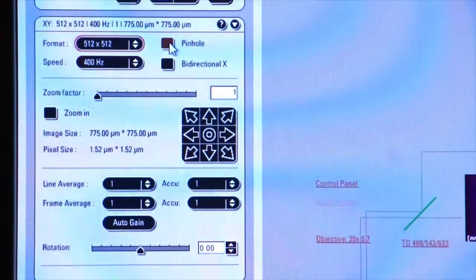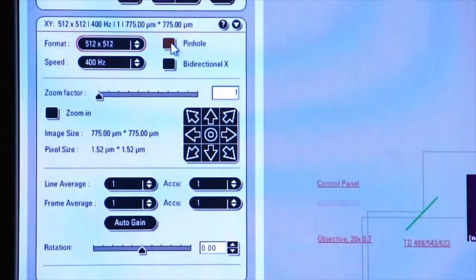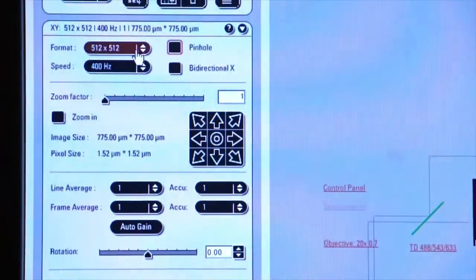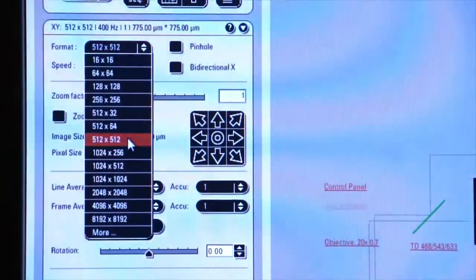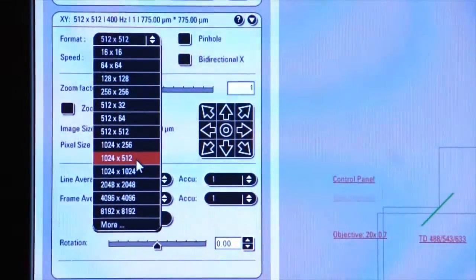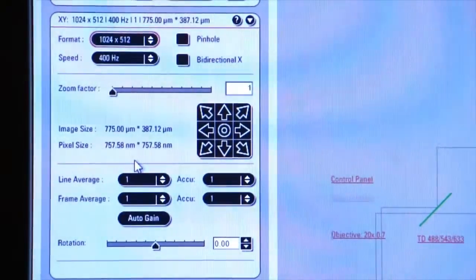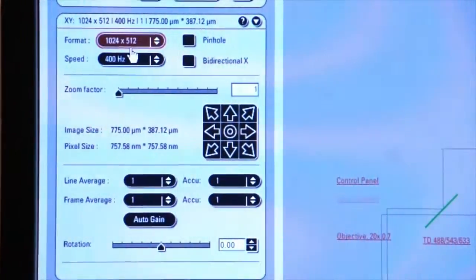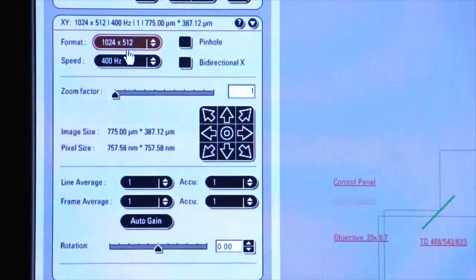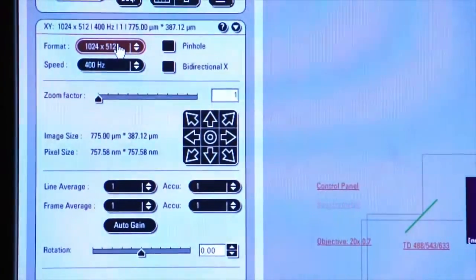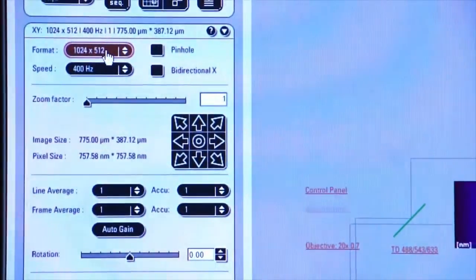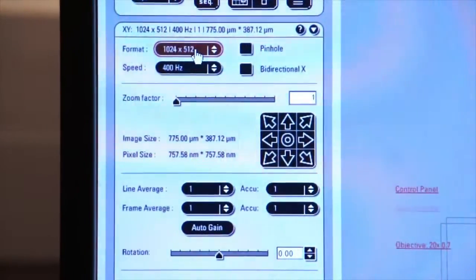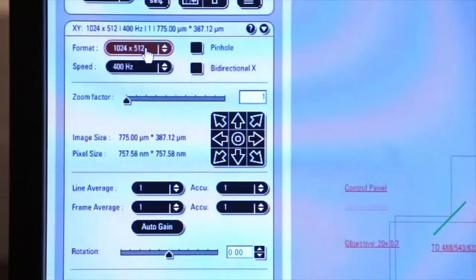We'll do that by selecting 1024 by 512, which will give us a long, narrow window, which allows the refresh rate to be a little faster so that we can position our slide the way we want it and minimize photo bleaching.